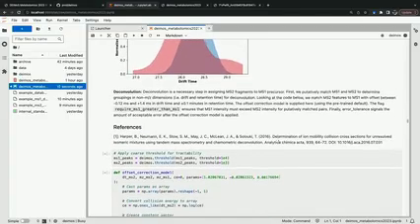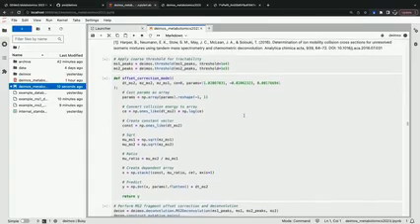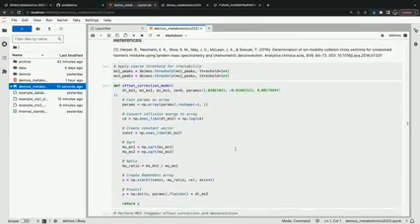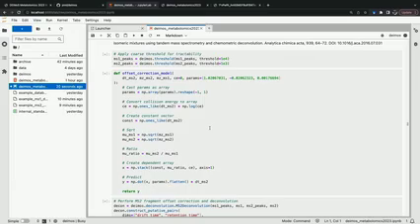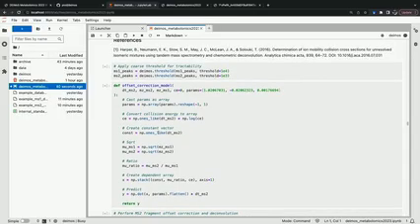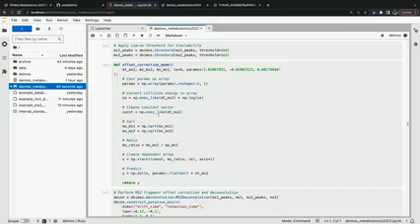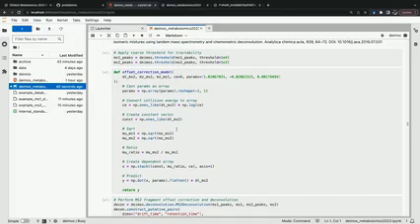The way that this is designed to be handled in DEIMoS is essentially you can specify your offset correction model. We've included an offset correction model that we've determined based on the analysis of our data. And so we found a relationship that, as Jess mentioned, includes the observed drift times and then the collision energy as well. And so here we're just including that offset correction model, but you can specify your own.